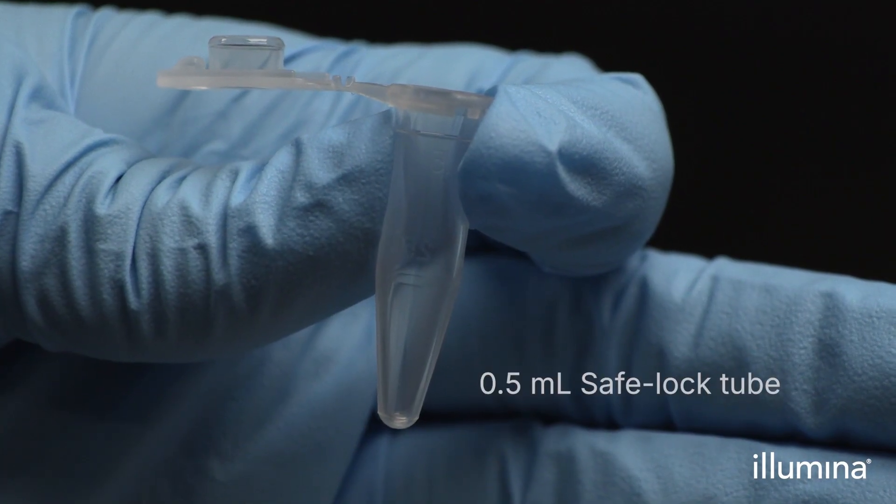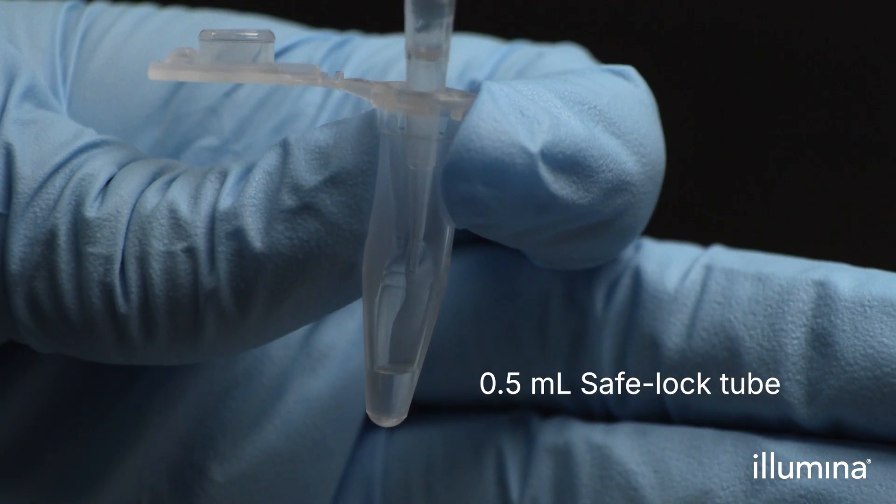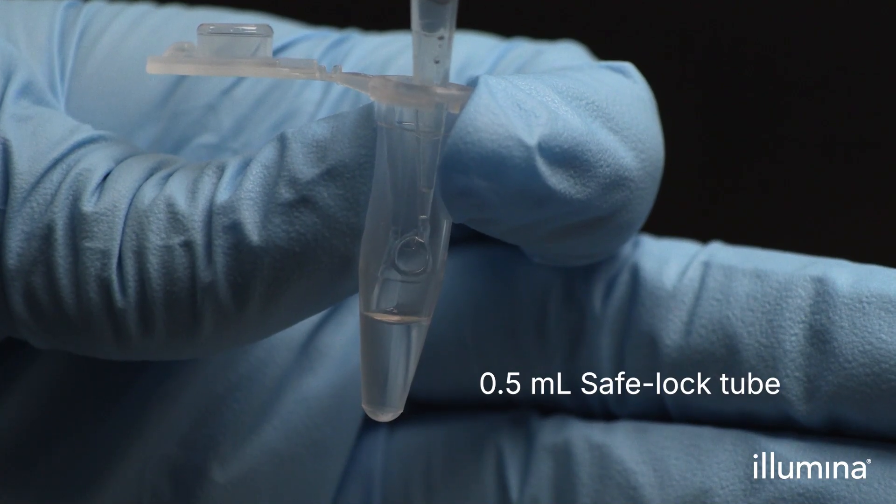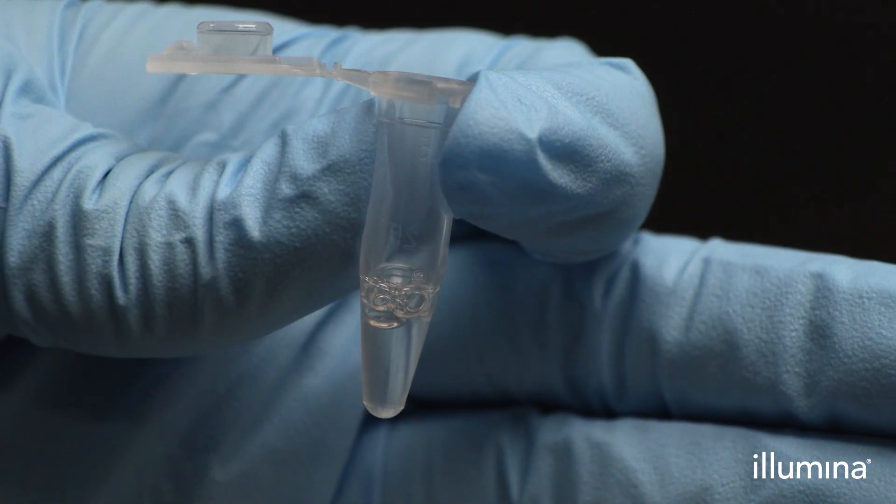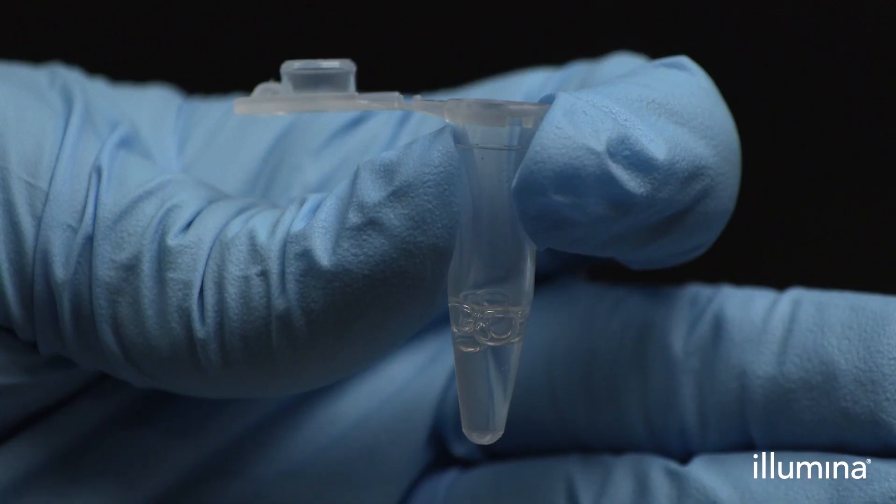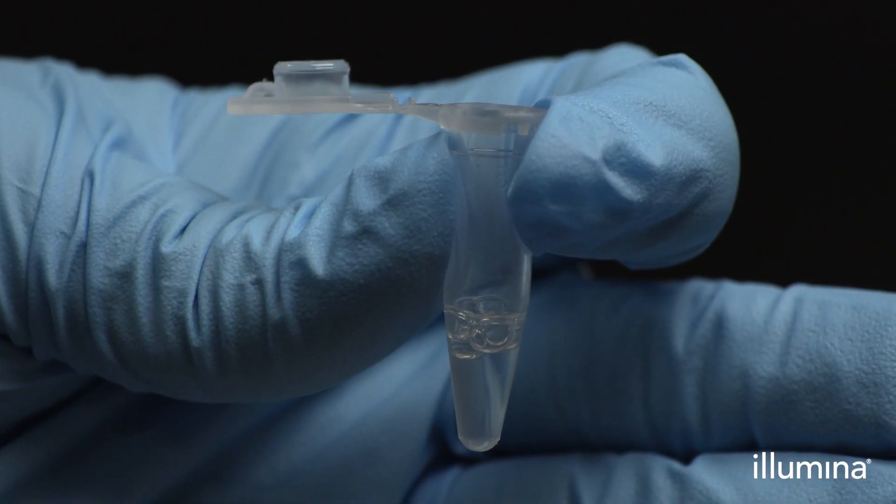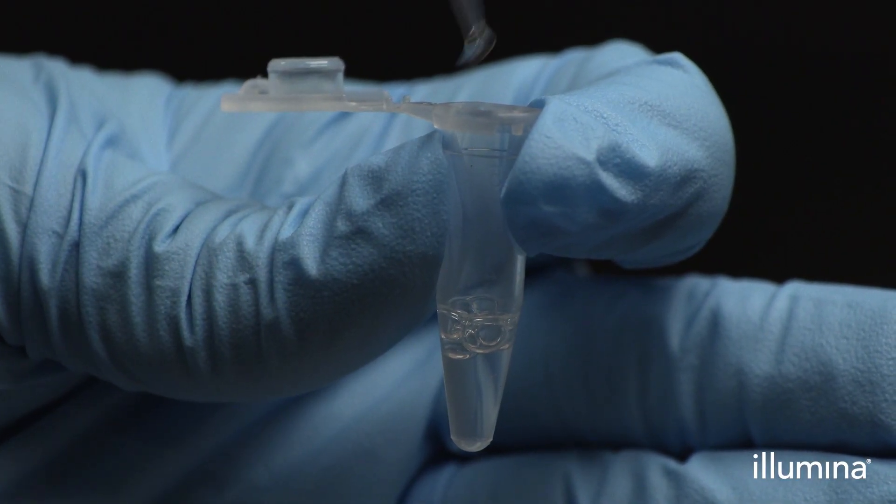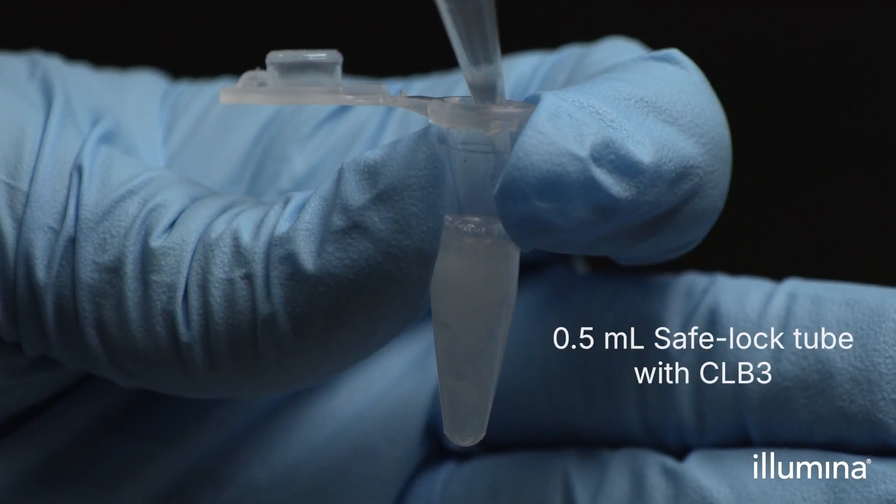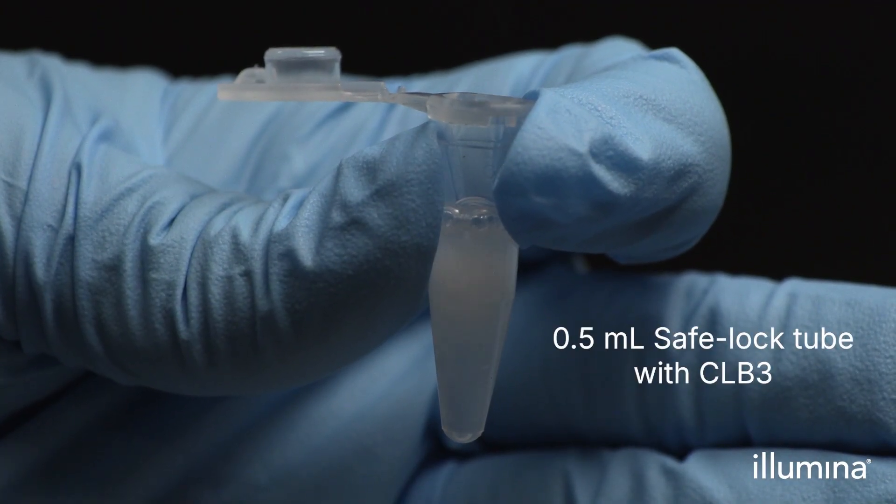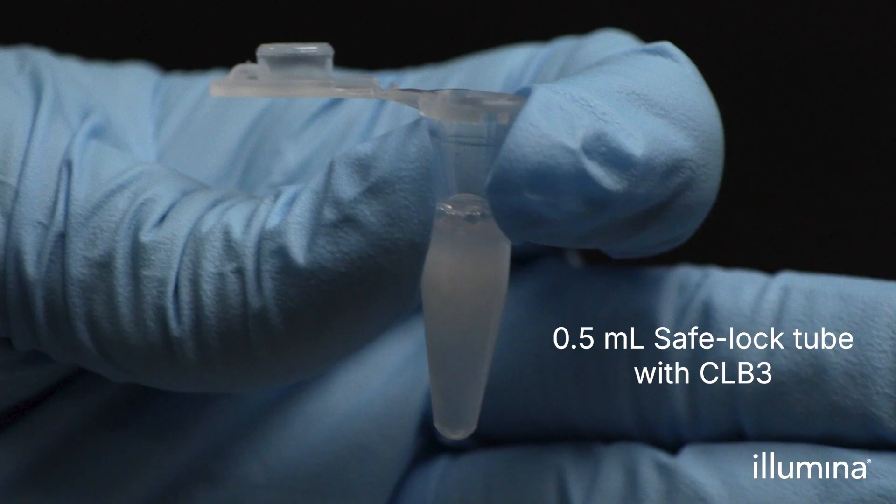Aliquot 90 microliters of CLB3 into a 0.5 ml Eppendorf safe lock tube for each sample being processed. For the remaining chemical lysis steps, we recommend processing one sample at a time. Add 270 microliters of partitioning reagent down the sidewall of one 0.5 ml tube containing CLB3.